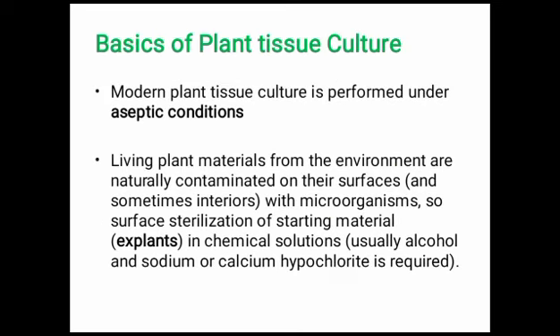What are the basic concepts of plant tissue culture? First, modern plant tissue culture is performed under aseptic conditions. This is a very important part of plant tissue culture; aseptic conditions are required for the development of plants grown by the plant tissue culture method. Aseptic, or sterilized, conditions mean totally free from organisms.